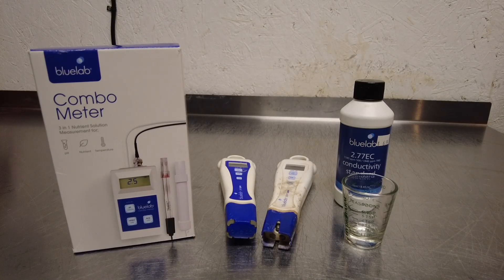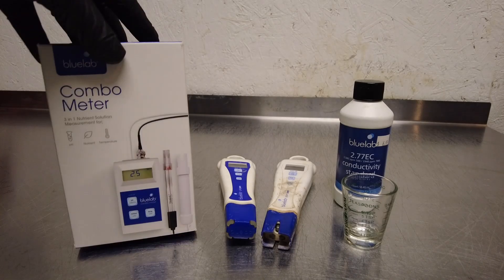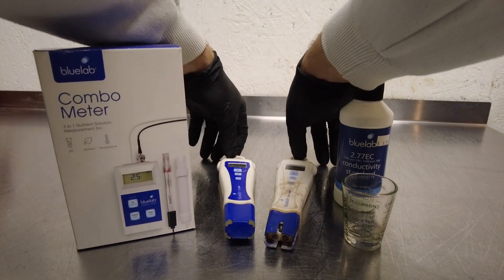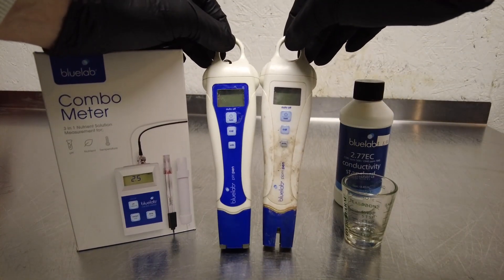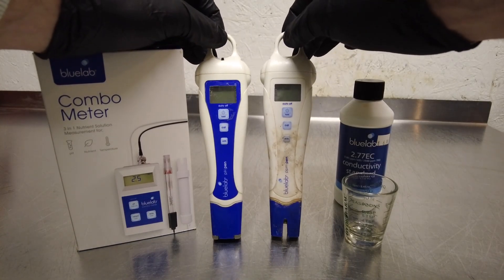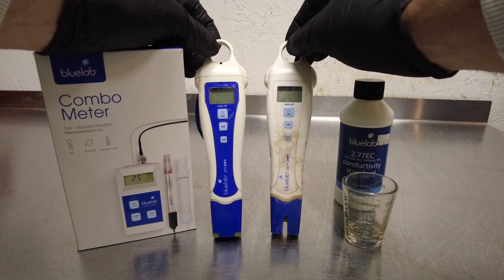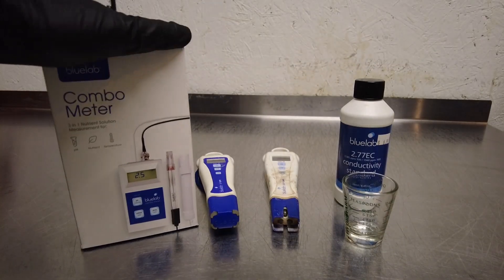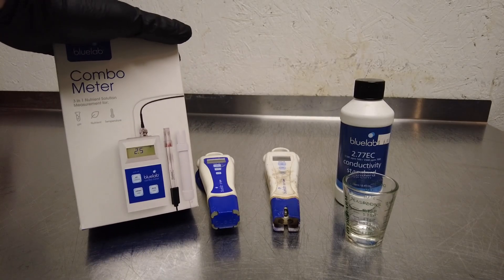Hey everybody, it's me ForGrowly here and today we're coming at you with a quick video regarding the Blue Lab combo meter. So as you can see here, I've got my pens — these are the Blue Lab pH pen and PPM or EC pen. I've been using these for years and years, this is probably like my third set of them.